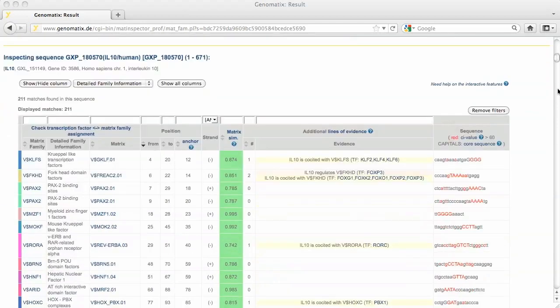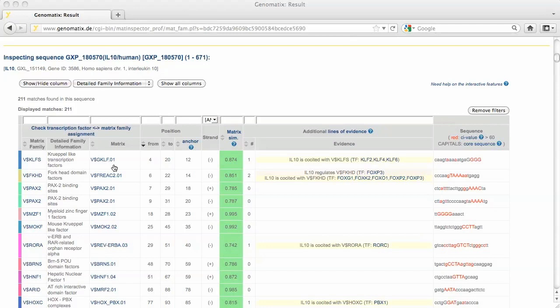For each promoter, a sorted list of matches is displayed. The first columns show the binding site family symbol and description, and the binding site matrix representing the family at this position. Matches are sorted by position within the sequence. The matrix similarity measures the similarity of the sequence at this position to the matching binding site matrix.